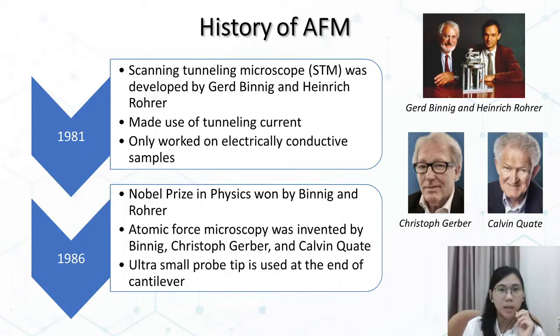So people tried to extend the STM technique to investigate electrically non-conductive materials like proteins, polymers, ceramics, composites, glass, or biological samples.